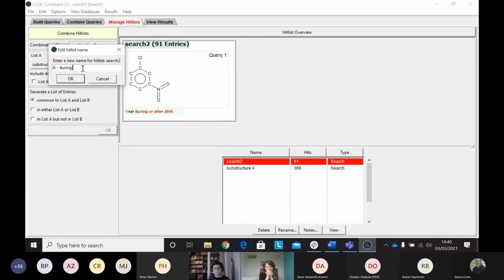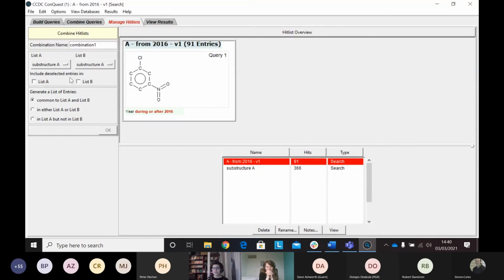during, let's do from 2016 version 1. Why version 1? Because there's another way to do it. Actually, this would be version 2 because we mentioned another one. So if we are all happy up to here, we can see the third way to do it.